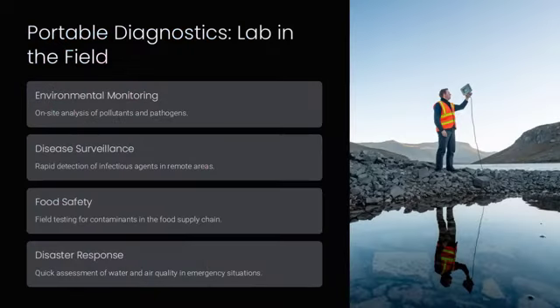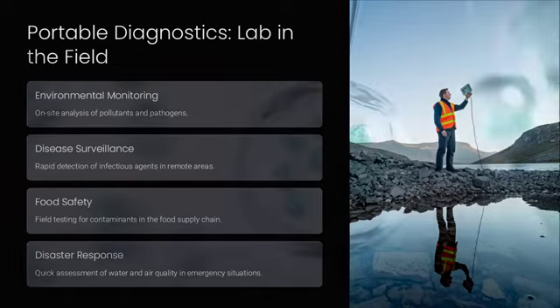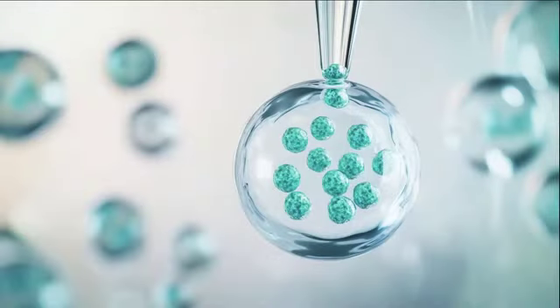Microfluidic valves control fluid routing with high precision by opening and closing channels on demand. For instance, pneumatic valves can direct reagents to specific reaction chambers in a controlled sequence, much like traffic lights regulate vehicles at intersections to ensure smooth and orderly flow.